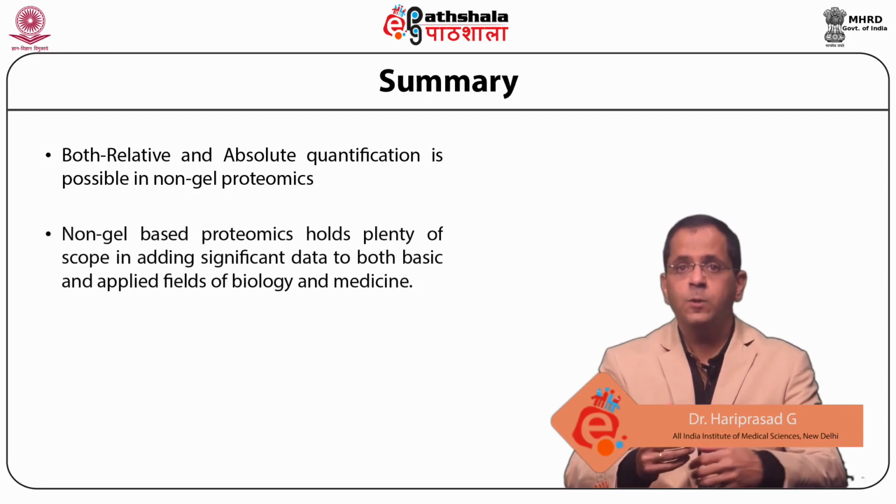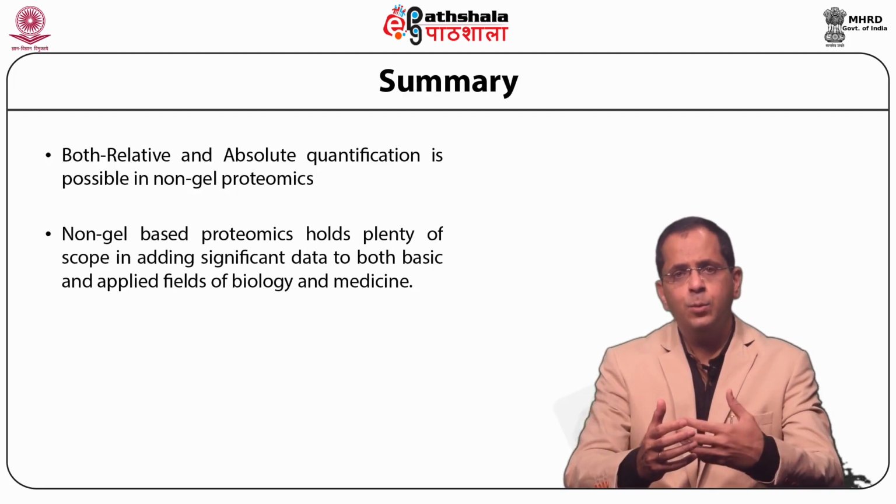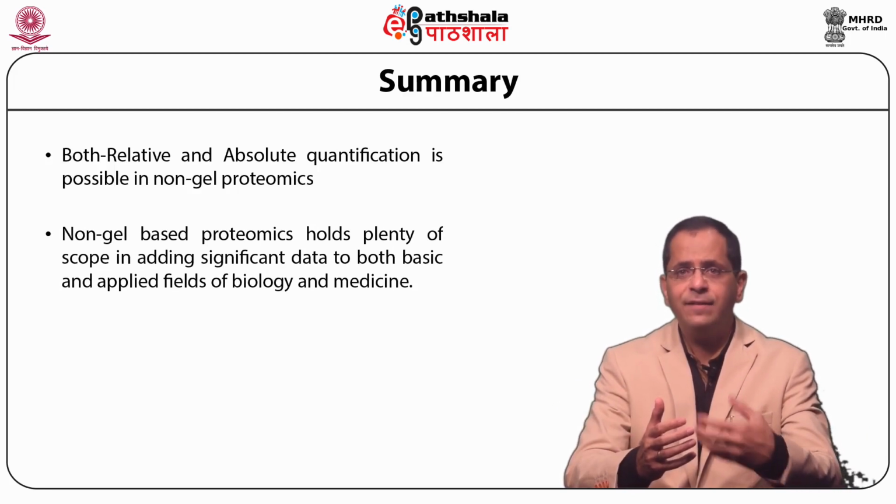Non-gel based proteomics holds plenty of scope in adding significant data to both basic as well as applied fields of biology and medicine.